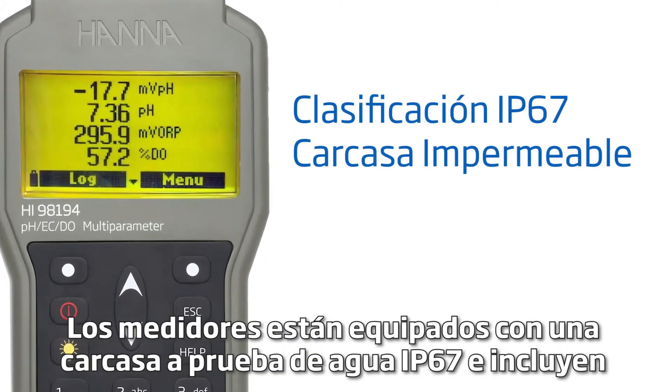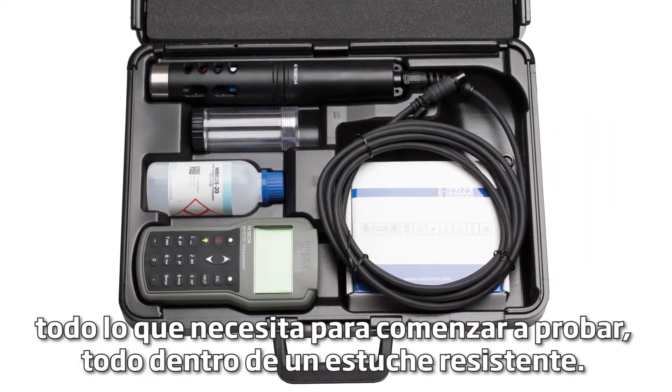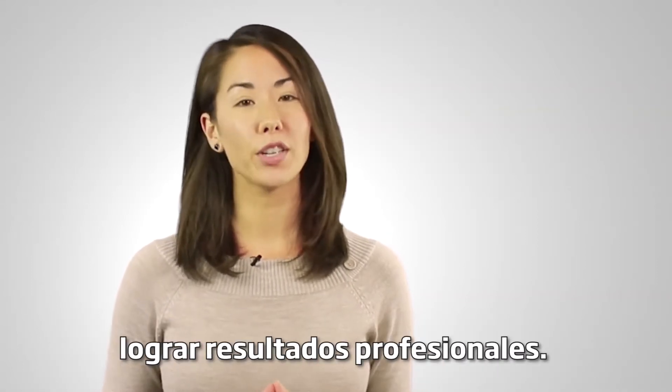The meter is equipped with an IP67 waterproof housing and includes everything you need to begin testing, all packed inside a rugged carrying case. Hanna Instruments provides you with affordable, quality equipment to help you achieve professional results.